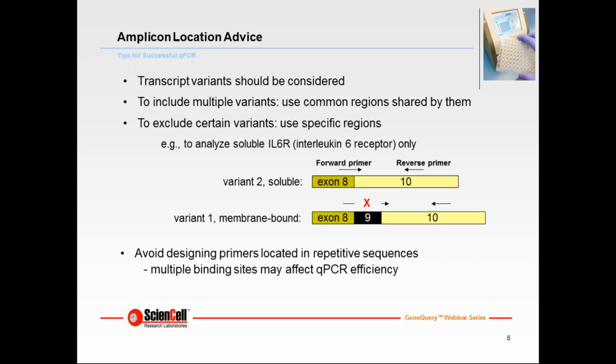In addition, when working with cDNA libraries, one important factor to consider is to avoid primers located in repetitive sequences, as the multiple binding sites may affect qPCR efficiency.